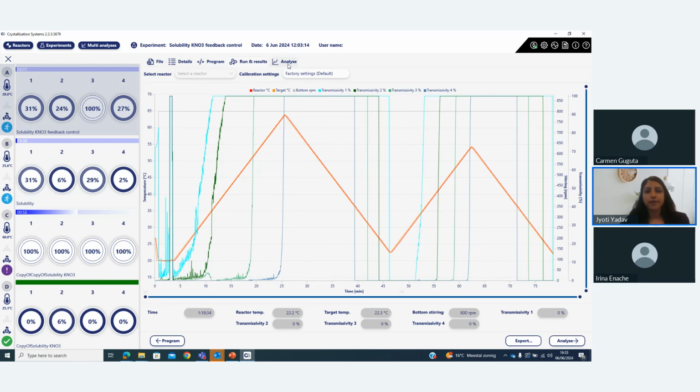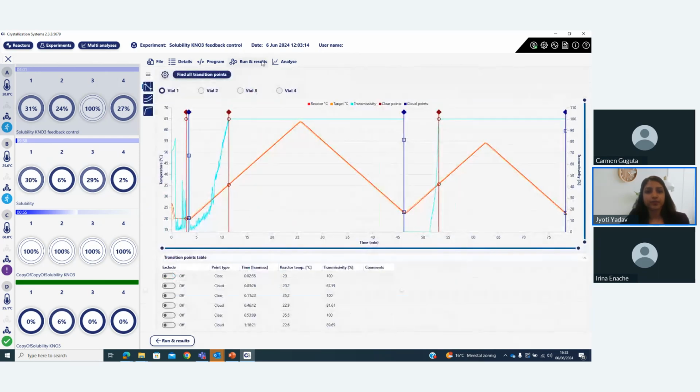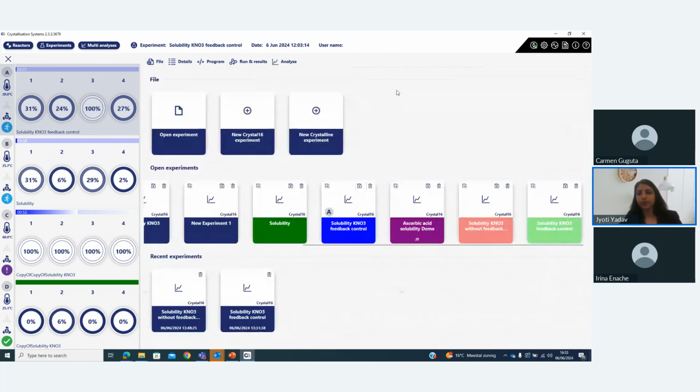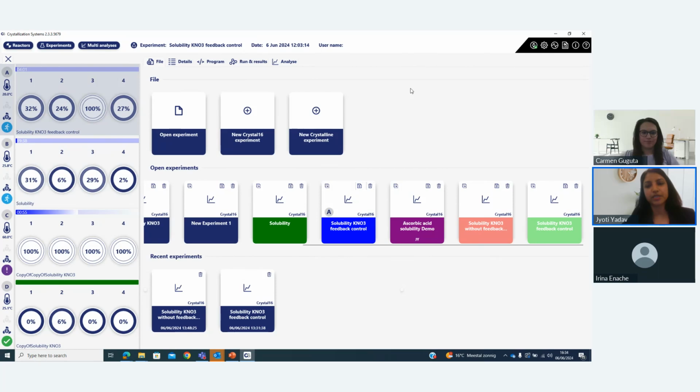I think this is all with the software. And yes, I think this is all with the Crystal16 training. If you have any questions, please feel free to ask. We can have a discussion on the different questions you have. Thank you very much, Jyoti.